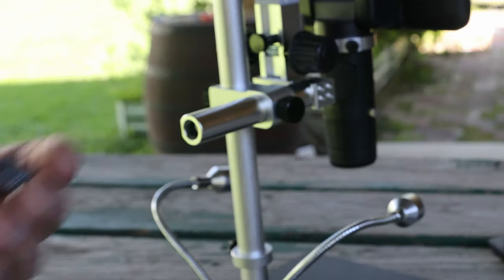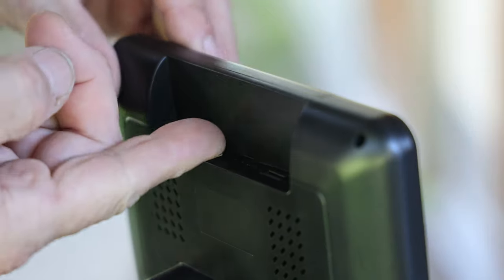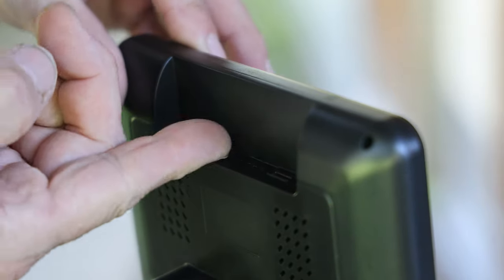There's an included 32GB micro SD card, which goes on the flat plain surface on the back side of the monitor. In my opinion, this thing is a little frustrating to remove. The part that catches your fingernail to remove the card is on the side close to the wall, so sometimes it's a little hard to pull out.